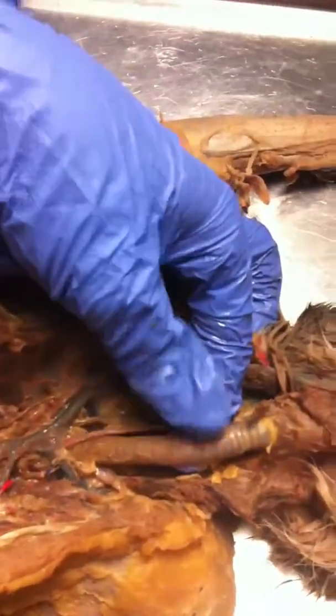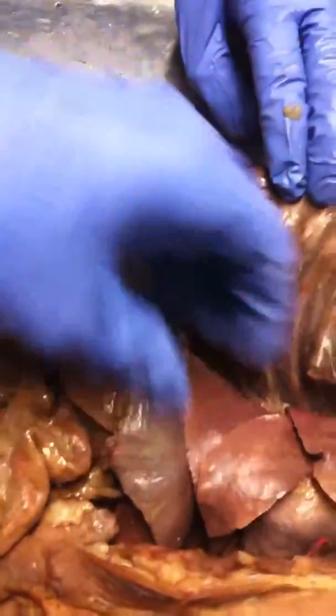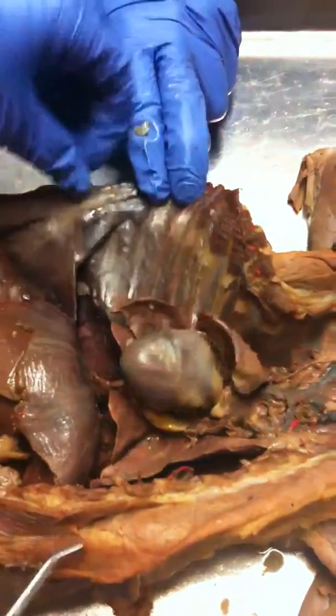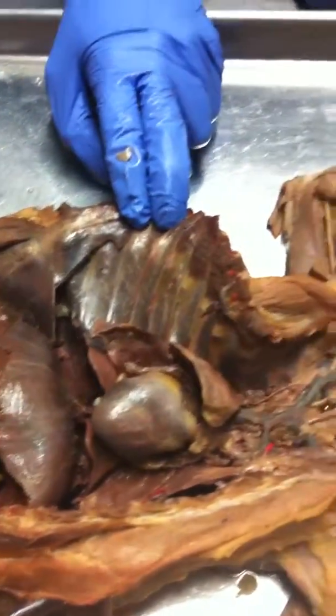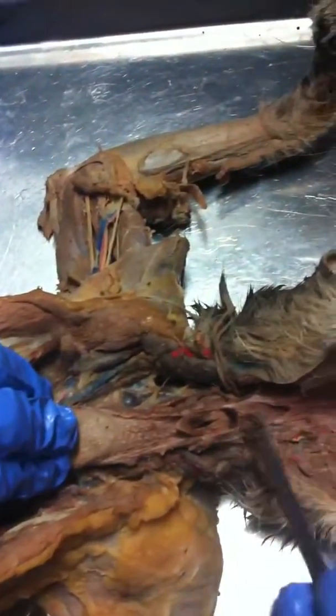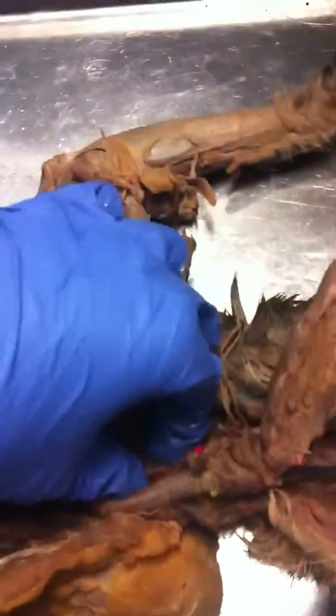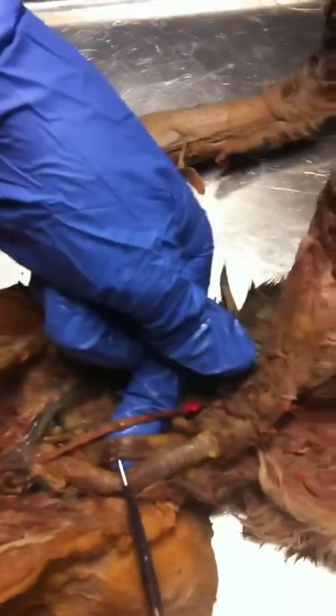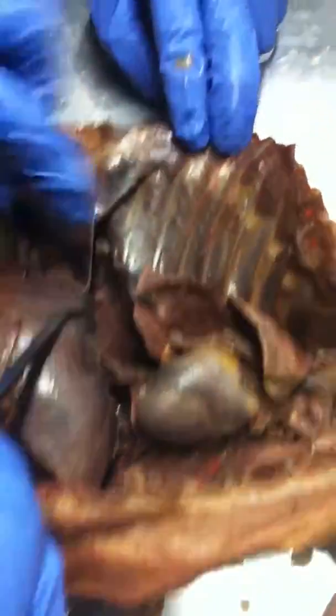Tracheal cartilage. You can see the tracheal cartilage in it, right? And the lungs. Lungs, here's some lungs, there's some more lungs. Okay. Esophagus. Esophagus is below the entrance to the trachea. Okay. So it's the second hole back, and it's below the trachea. Okay. Diaphragm.